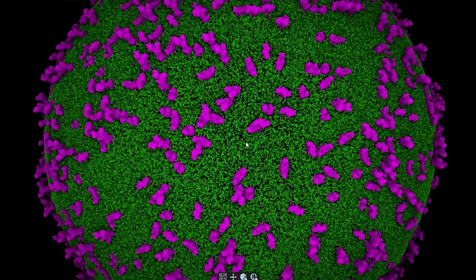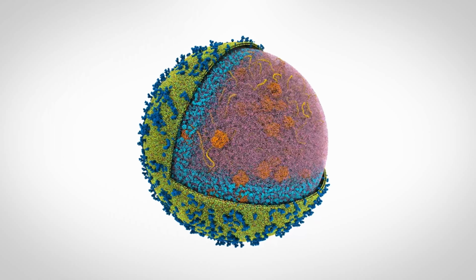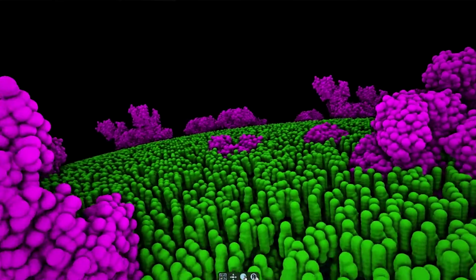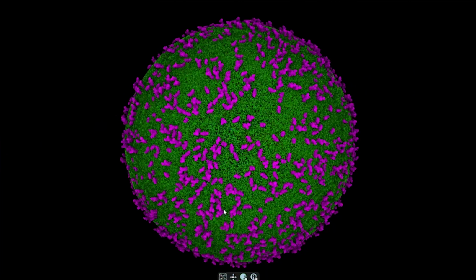We will construct the cellular architecture using information from cryo-electron tomography and soft X-ray tomography. And this will give us information about where the organelles are, like the nucleus, the mitochondria, the vacuoles, the endoplasmic reticulum, ribosomes. Initially, we'll focus on well-studied bacteria and yeast with the long-range goal to be able to build models of human cells. So our goal is at the end to give out our 3D models of cells and bring them to life on a computer and eventually in Minecraft.